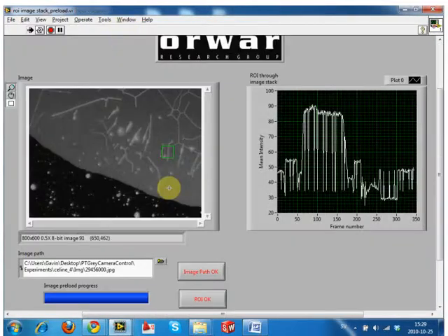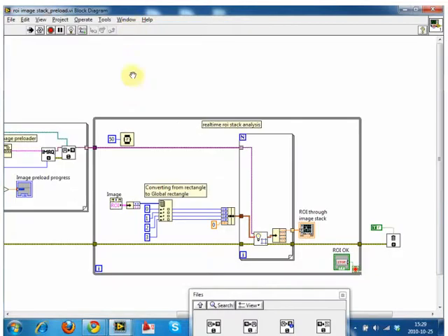Sometimes you don't need all of the files crazy quick, but if you're doing, let's say, 10,000 files, it's going to be pushing it to do it in real time. So what you could do then is limit the loop. What we could say here is still pull in all the data, just like in the previous example, with this light bulb thingy, but we action it later on. But we put a limit on here and say, look, I just want to see how the first 500 files look. And then in real time, you'll be able to look at the first 500 files.